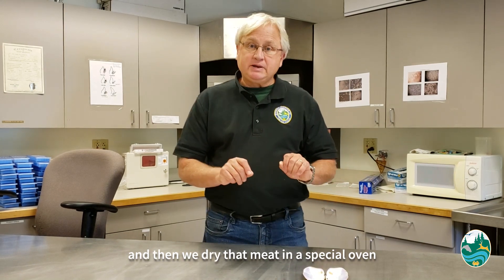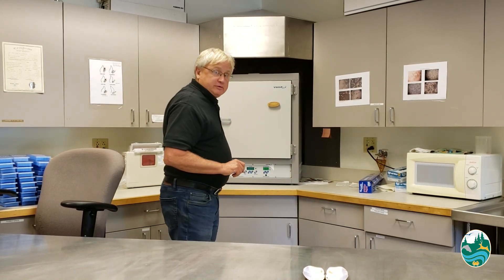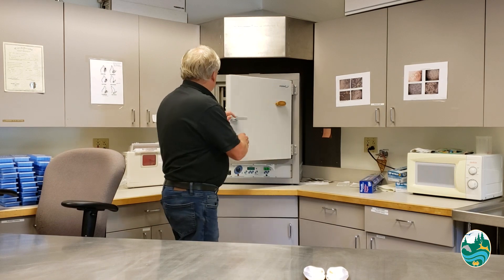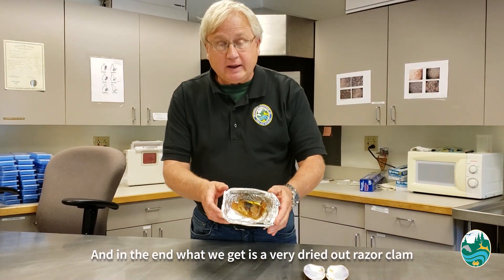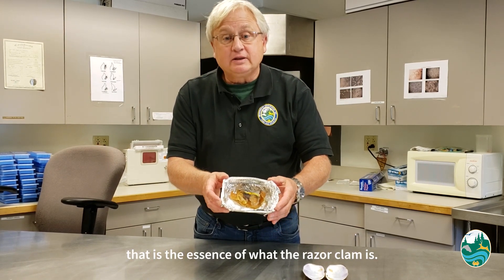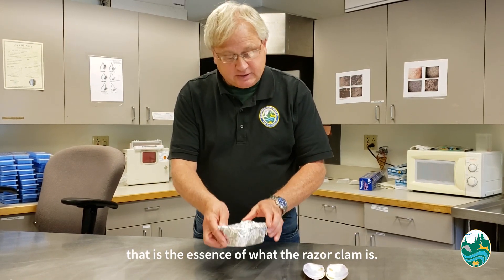And then we dry that meat in a special oven, and in the end what we get is a very dried out razor clam that is the essence of what the razor clam is.